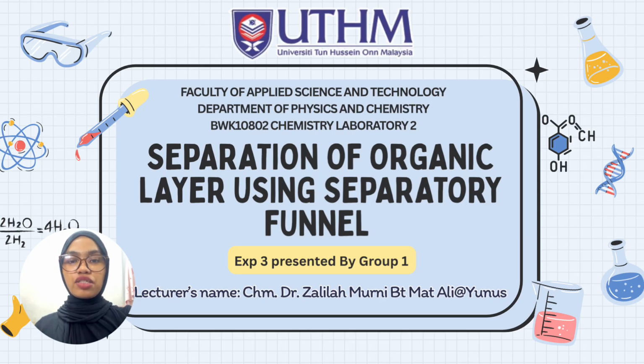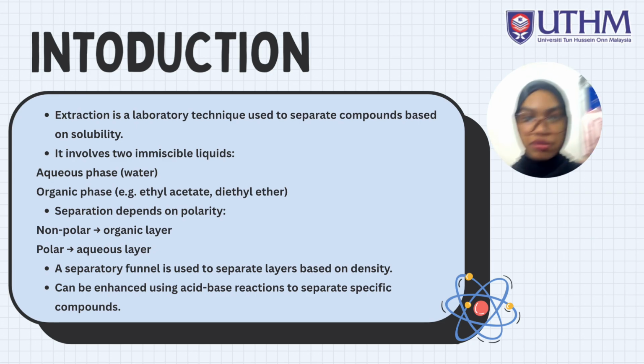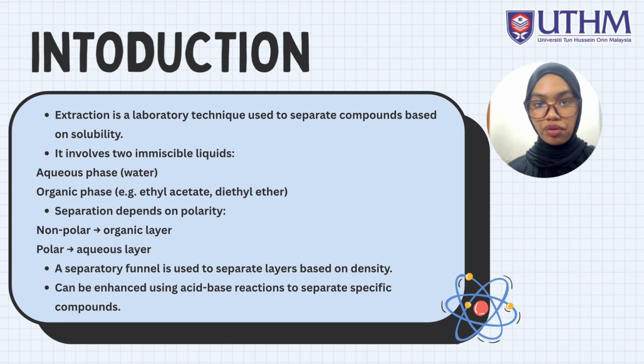I'll be explaining about experiment 3, which is separation of organic layer using separatory funnel. For the introduction, firstly, extraction is a laboratory technique used to separate compounds based on solubility. It involves two liquids, which are the aqueous phase and the organic phase, and separation depends on polarity. Non-polar forms the organic layer. Polar is the aqueous layer.